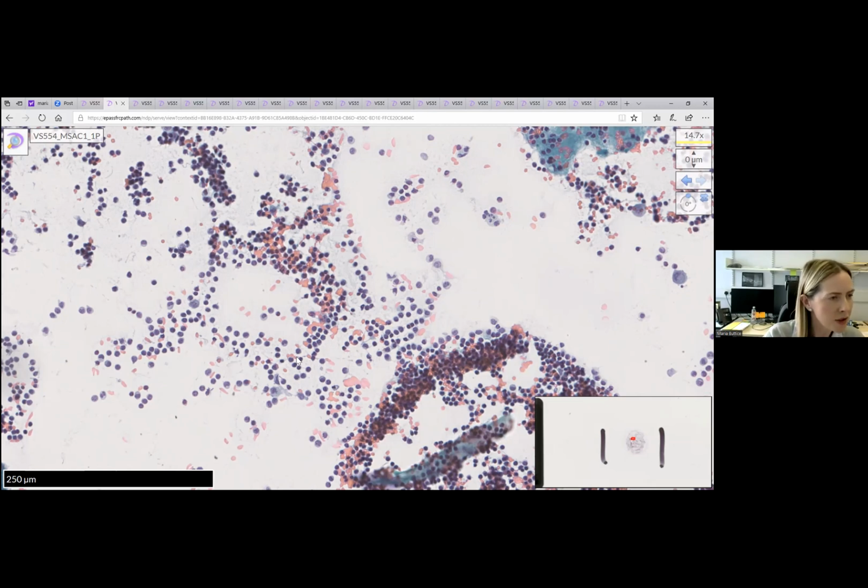Yes, excellent. So it can be associated with TB, connective tissue diseases such as rheumatoid. We can often find it in patients who've got cardiac failure. A lymphocyte-rich effusion is also common post-surgery, and viruses, absolutely. Yep, and I think also you could state that you can use the term lymphocyte-rich effusion when more than 50% of your nucleated cells comprise small lymphocytes. So yeah, that's excellent, correct. Any other questions with regards to this case?